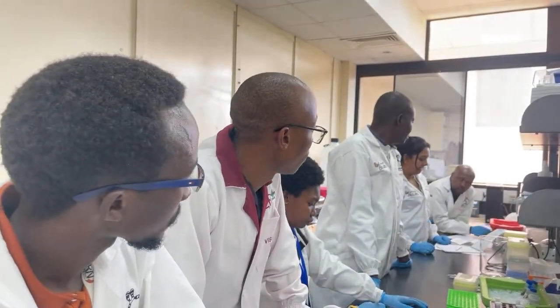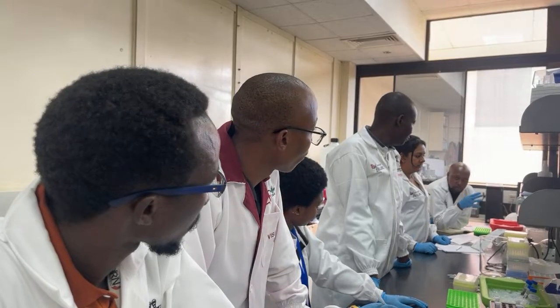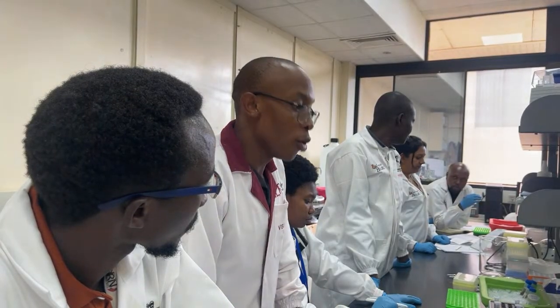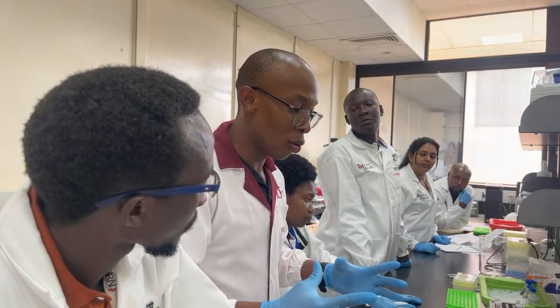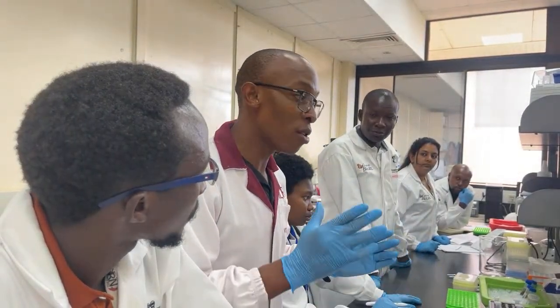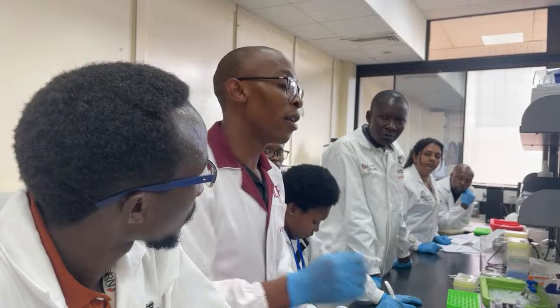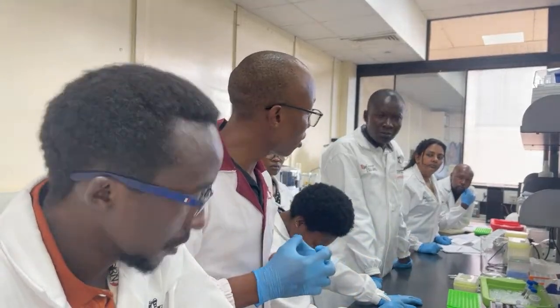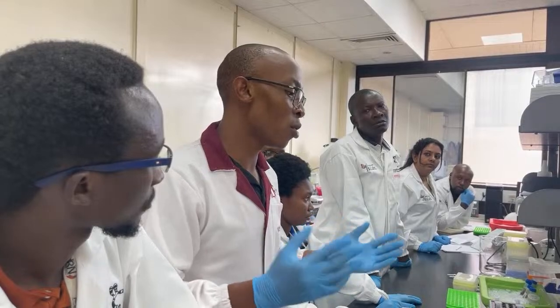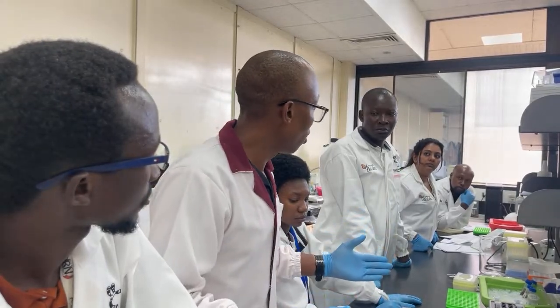Question. For some of the organisms in Africa, maybe they have not been genotyped before. I believe maybe they are even orphan crops or orphan organisms. So how are you going to determine the genome size? Usually in that case, if there's no reference or anything related that is sequenced, as a service provider we just go straight with one cell for that one organism. Then from there we do the assembly, and that will tell us how much we still need, or if we predicted right and one SMRT Cell is enough. So it's always worked like that. Some people also do genome mapping to get an idea of what the genome size is.